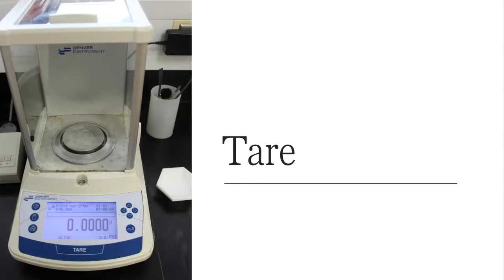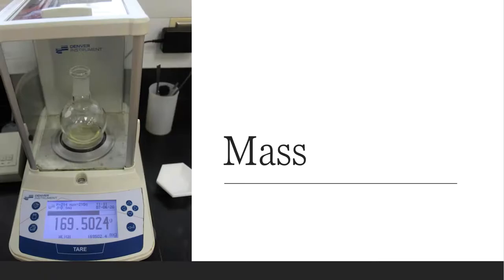So what I had to do is go back to the balance and re-tare it out. Okay, so I'm seeing 0.0000 on the screen. And then I'm going to get a mass of that boiling flask with the oil in it. And that's 169.5024. But at the same time, you have to keep in mind that those solid little chunky particles are still in there. Whatever those were, I don't know. But they are somewhat contributing to the mass of this sample that I've ended up with. Right? Okay, so now we need to test it.